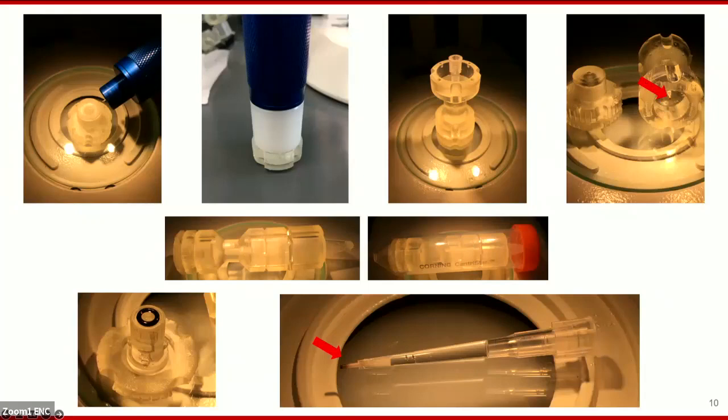In our pipette tip here with the rotor installed in the bottom, we have a large water column and a packed pellet of nanocrystals that is overflowing out of the rotor, meaning that the rotor's full of nanocrystals, and this water column means that those nanocrystals are well hydrated. Now, this interface between the pipette tip and the rotor is not 100% perfect. It's going to leak a tiny bit. And so that's where the O-ring does its job. There's a little bit of water there, but the O-ring provided a backstop against that water column.